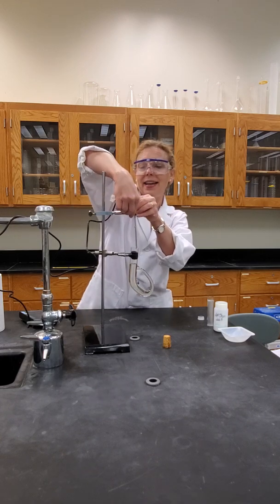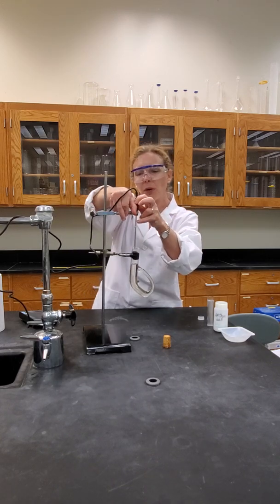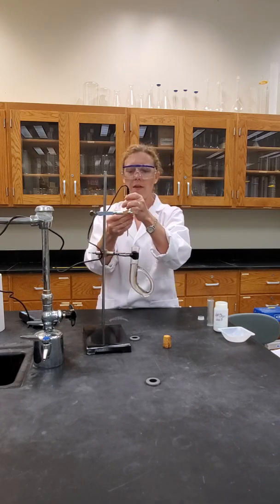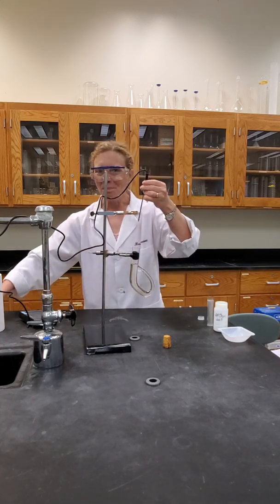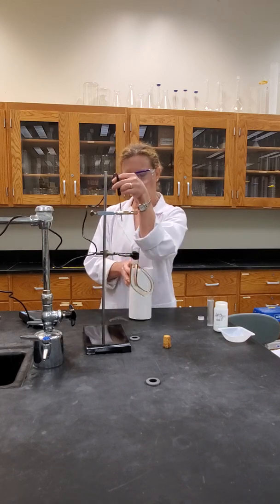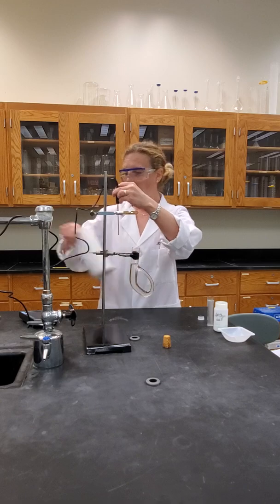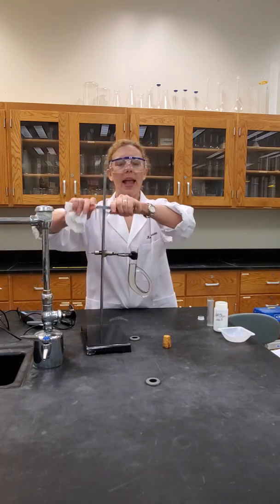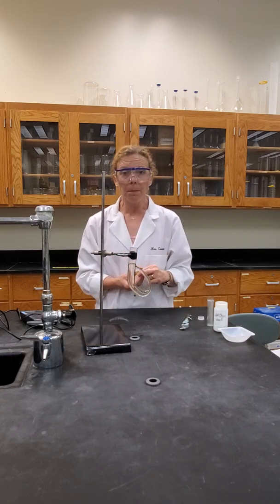You can go ahead and just extract off the capillary tube and the rubber band. We will not reuse those. So if you want to use the paper towel to take that off and then dispose of this, but we need to clean this. So then, get more of the soapy water and clean this off. Make sure you rinse it with water before placing it away. Anywhere else you may have gotten mineral oil, make sure you're cleaning it up with soapy water.